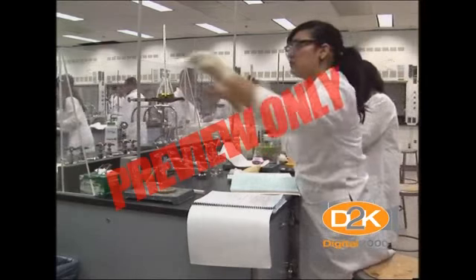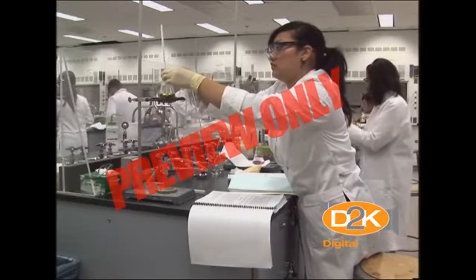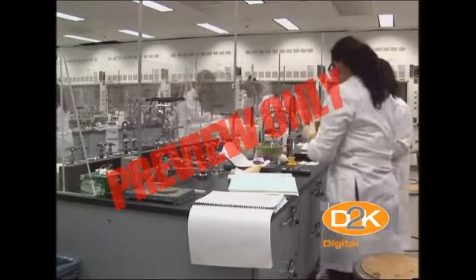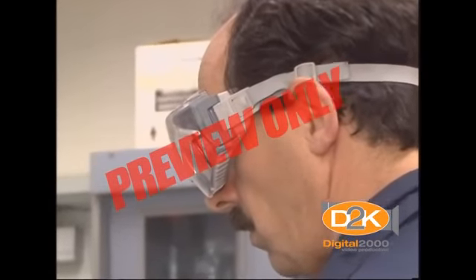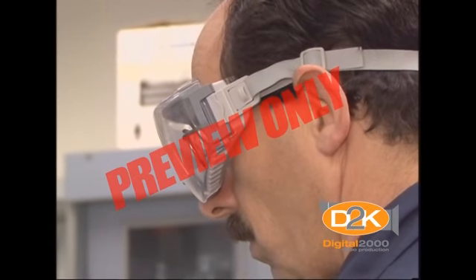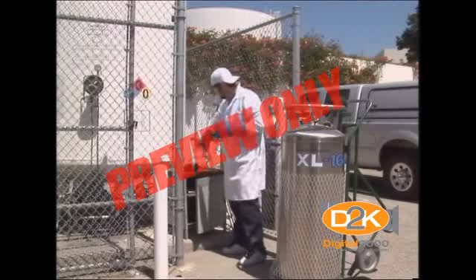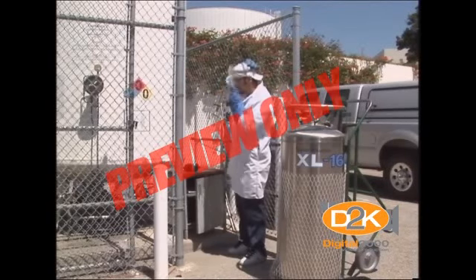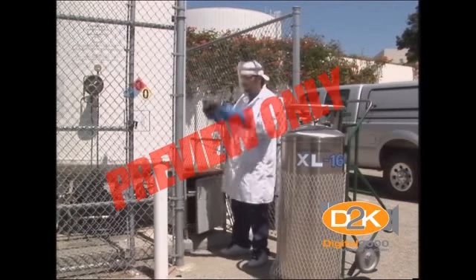Contact lenses should never be worn when working in the laboratory because chemical vapors can permeate the lenses and become trapped on the surface of the eye. For individuals who wear contact lenses or glasses, safety goggles are recommended instead of safety glasses because of the additional protection goggles provide. Face shields are designed to be used in combination with safety goggles to provide additional protection to the face and eyes against splashes and particulate matter.